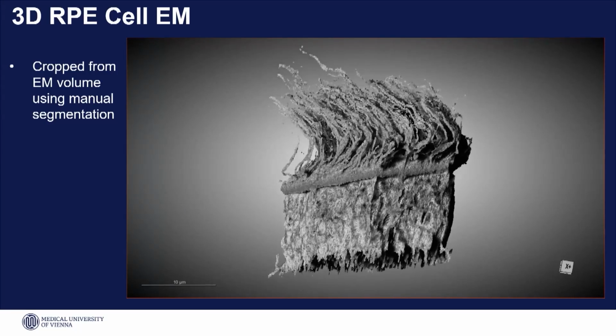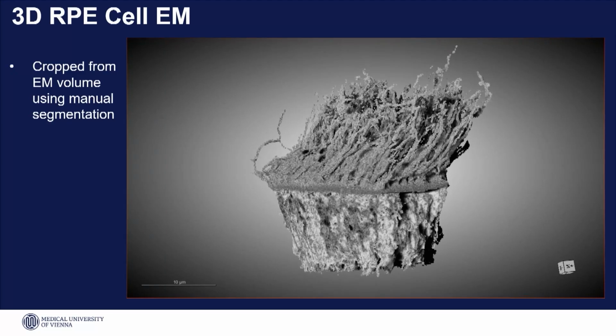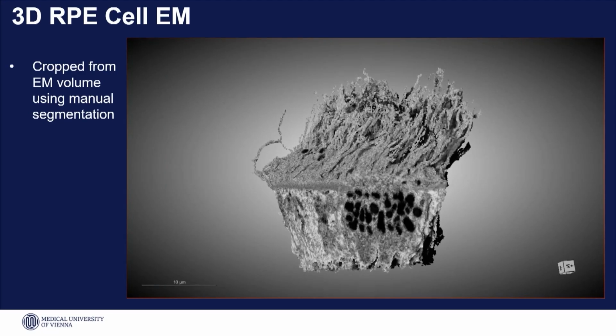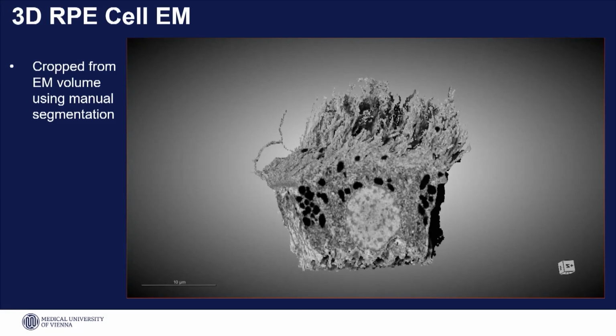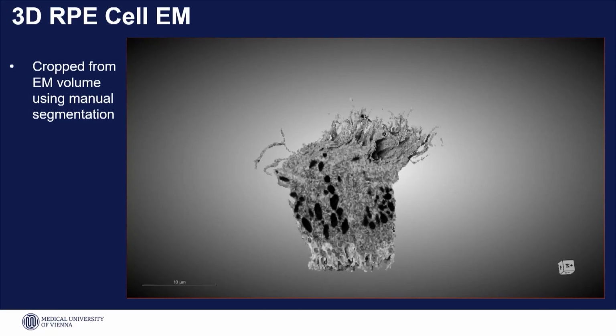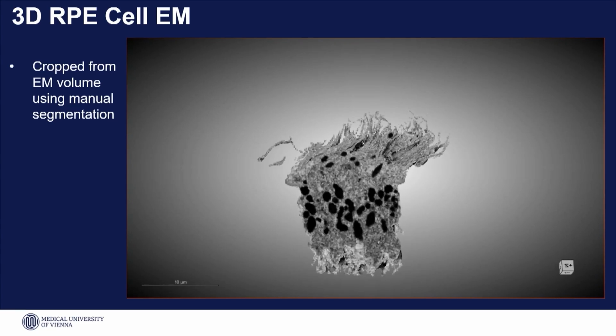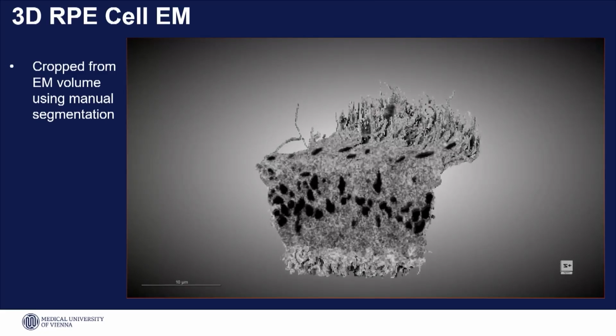This is just what we made with Dragonfly to show the volume and show it'll cut through, and you can kind of see the top half is full of these big dark blobs, and the bottom is somewhat more diffuse, and that's this strong polarity that I was talking about, and we'll get to that in a second.